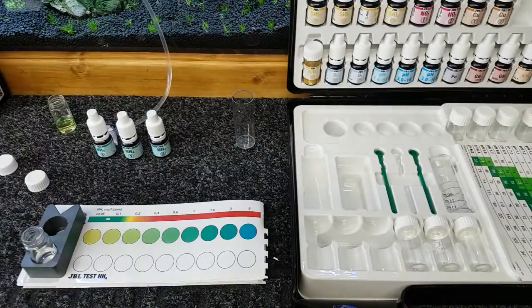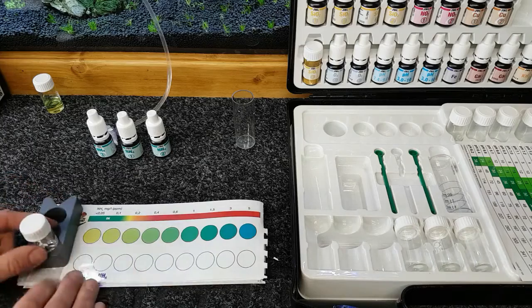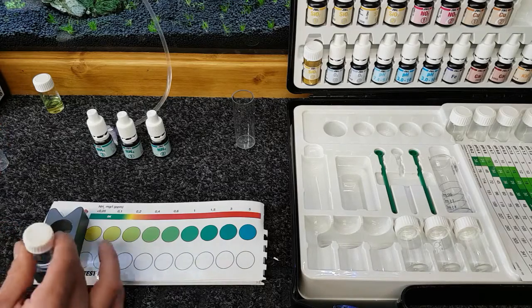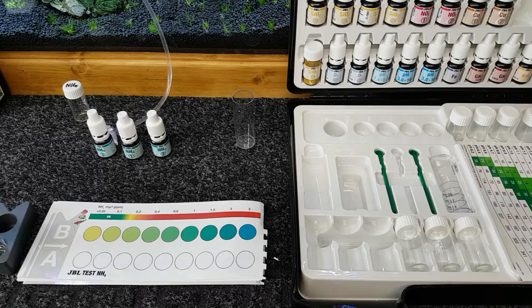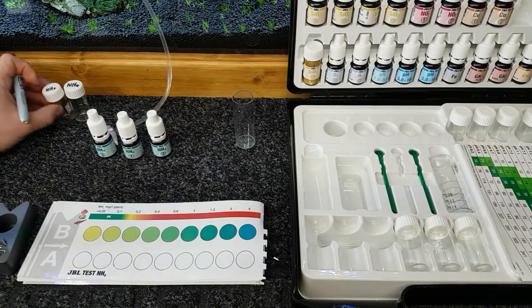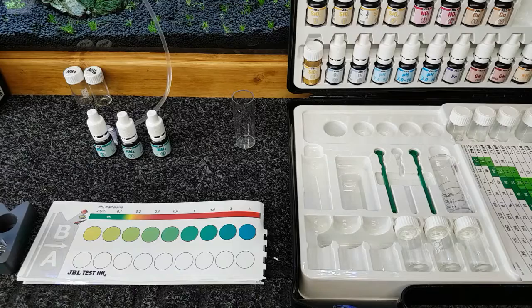Take another jar out, and then we can put 5 ml of water in that one as well. In fact, now what you do, I'm going to take that one out as well. Now I'm going to put on the top of there, with my little Sharpie pen, wherever it's gone. Right, here it is. I'm just going to grab the old Sharpie and write NH4 for ammonia on the top of that one, okay? There you go. Now I know that those two over there are for ammonia tests only, so we can put them to one side and we can wash them out later on.